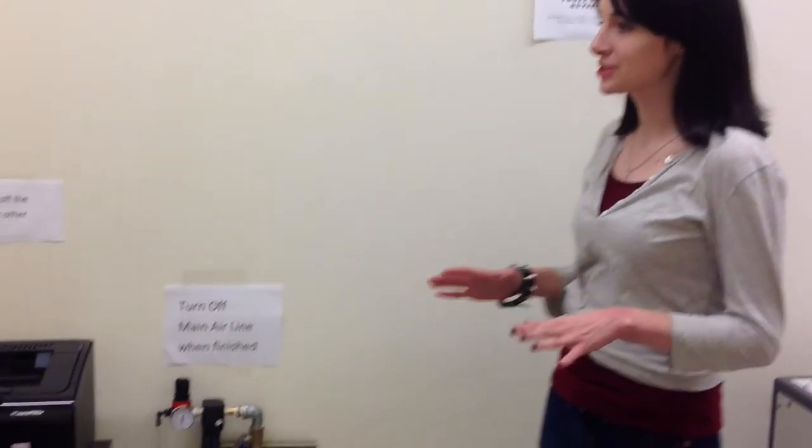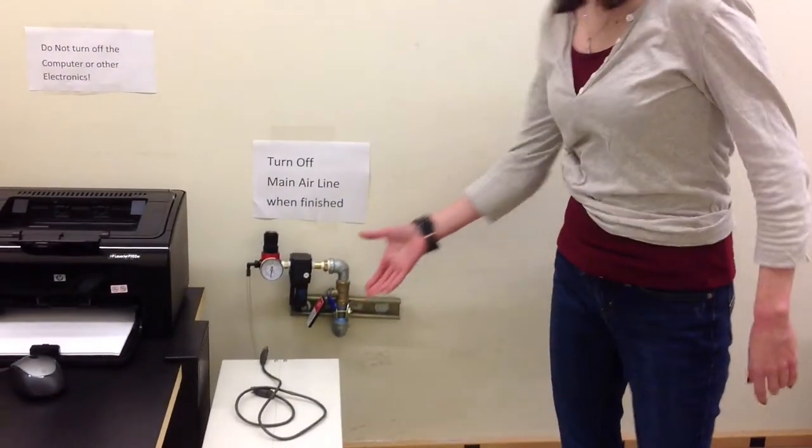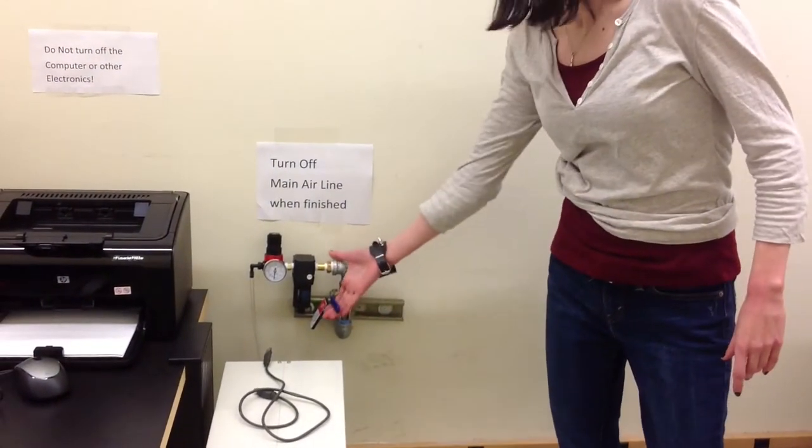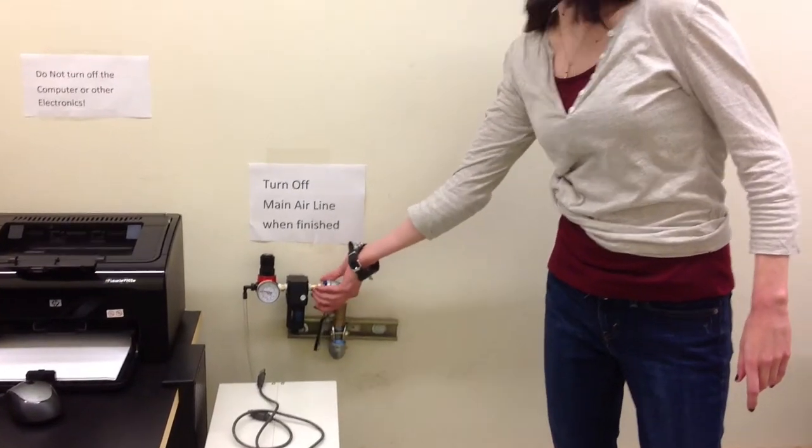First of all, you have to make sure your air supply is on. The first thing you have to do is lift up this lever right here and your air supply is on.